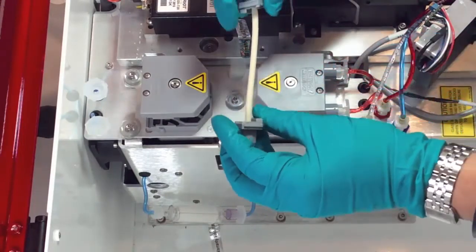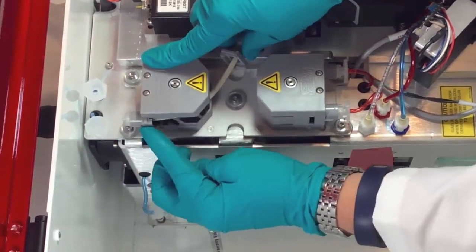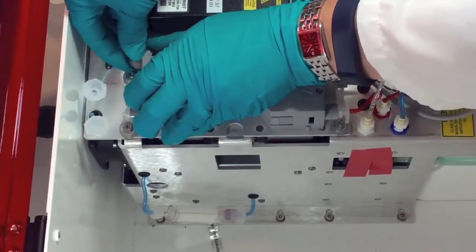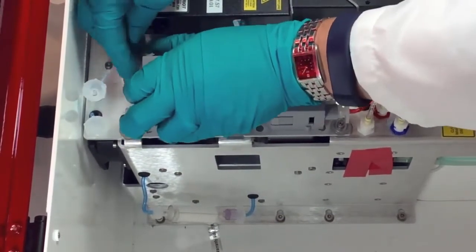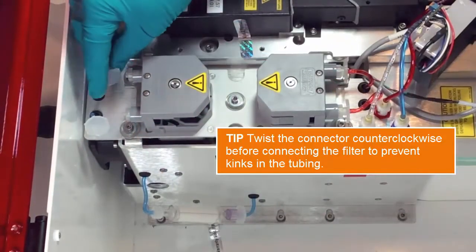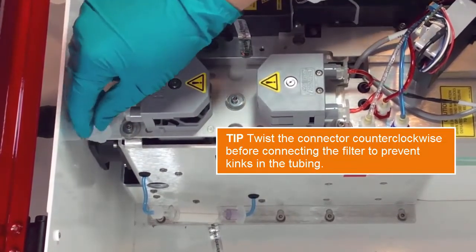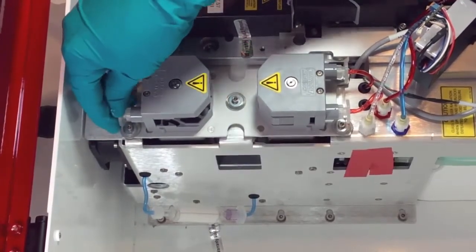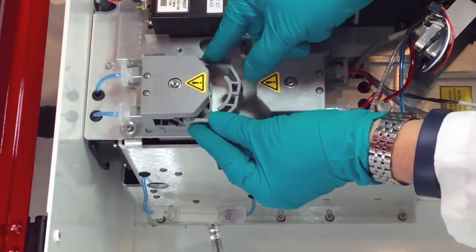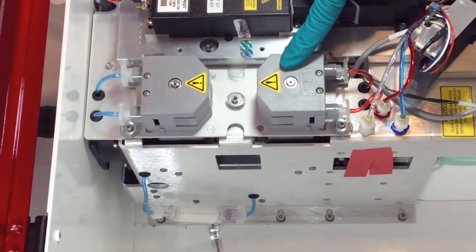Install new peristaltic pump tubing by sliding the luer fittings on the pump head, and snapping the fitting in place. Reconnect the tubing to the luer connectors. Replace the pump retainer clip. Now you're ready to repeat the procedure to replace the waste pump tubing.